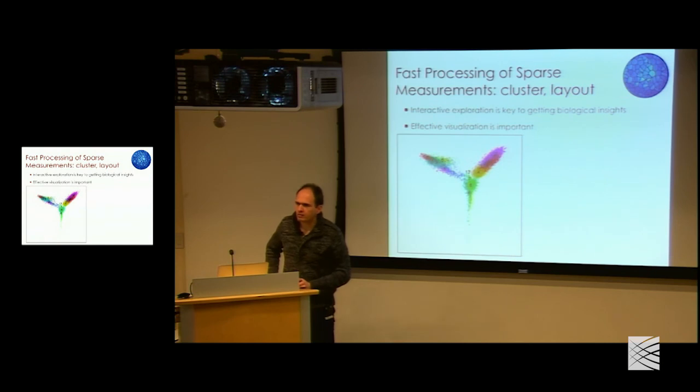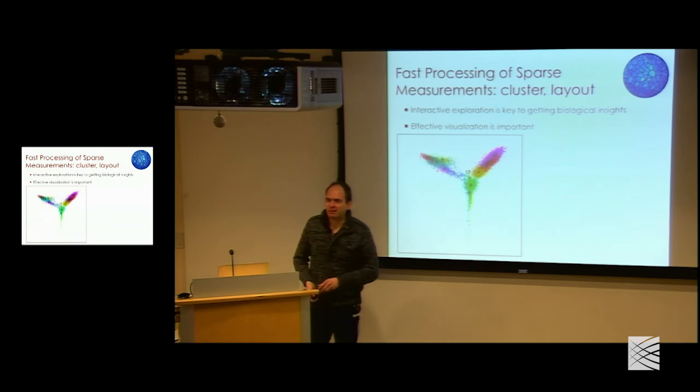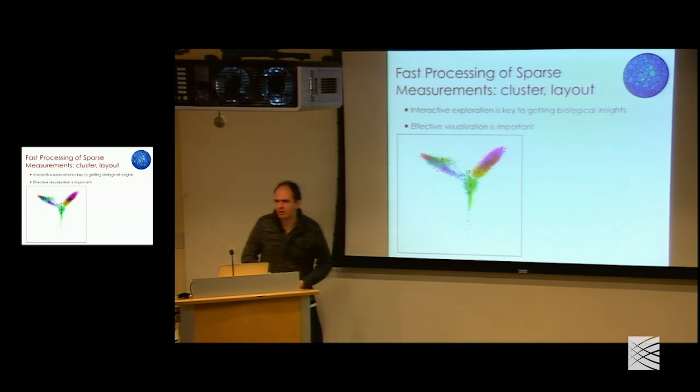Consider alternatives to that space itself, maybe using multiple kernels or... No, we haven't used. Actually, it's the second time I get asked that question. I guess I should look into it. But we considered alternatives. First of all, you could use the entire set as it is to get some transcriptome-wise distance measures, and on smaller data sets it works fine. We've tried things like random projections and so on. I haven't tried kernels, to be honest. Again, I think the idea was to make it really fast, and given how fast this PCA was, we figured we could do this. But yeah, good point.